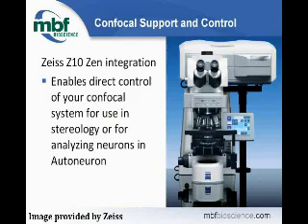With version 10, we now have confocal support and control. MBF and Zeiss have worked together to integrate our applications with their LSM confocal systems. So if you have a Zeiss 710 confocal, we can now control it. This allows direct control of your confocal system for use in stereology or for analyzing neurons with AutoNeuron or Neurolucida.